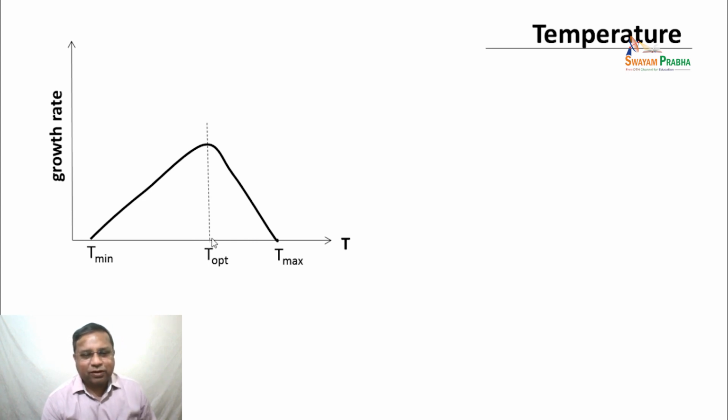Okay, I'll probably briefly talk to you about it, or maybe I can mention this. We have done some work on that. Let us say that the growth is optimum at a certain temperature, whereas the product formation is optimum at a different temperature. In fact, this is what we found when we did studies on hybridoma, the cells that produce monoclonal antibodies.